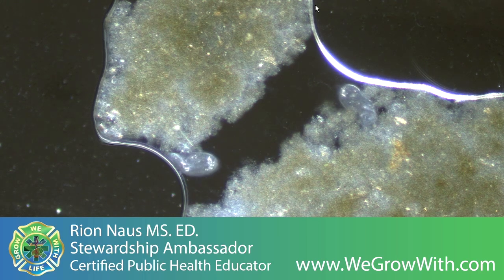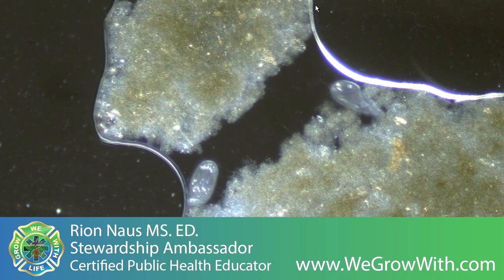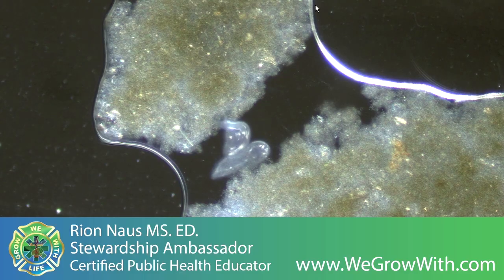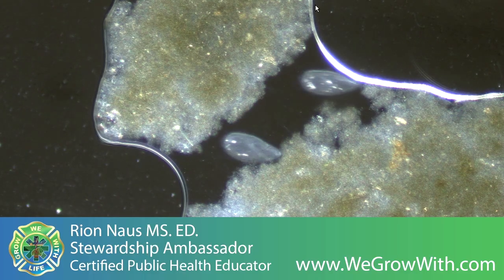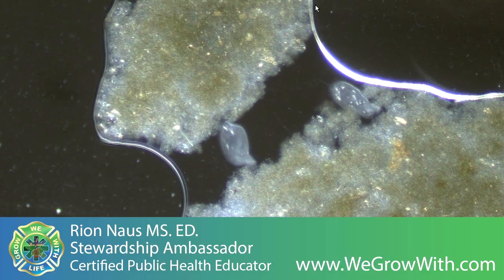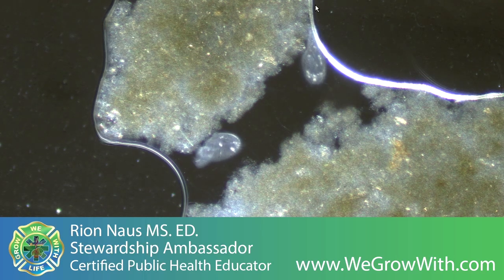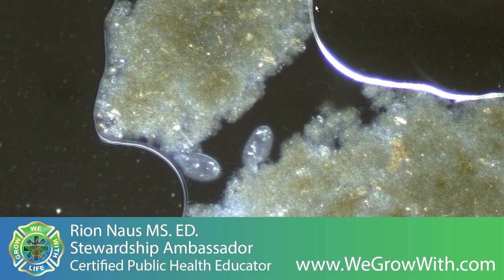And they'll fill that whole space, and you'll have roots that look like whatever you contain them in. This space, this size, the scale that we're looking at here, this is the mycorrhizal fungi, our arbusculars, the saprophytes, the creatures that are 10 to 100 times smaller than a root hair.